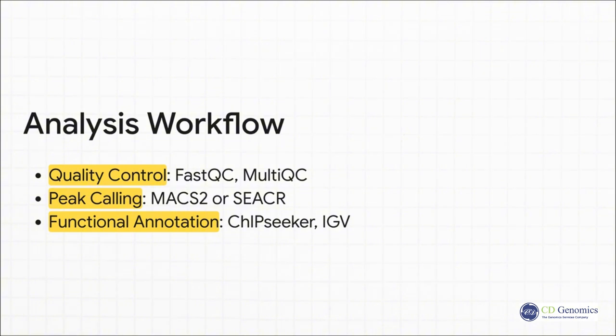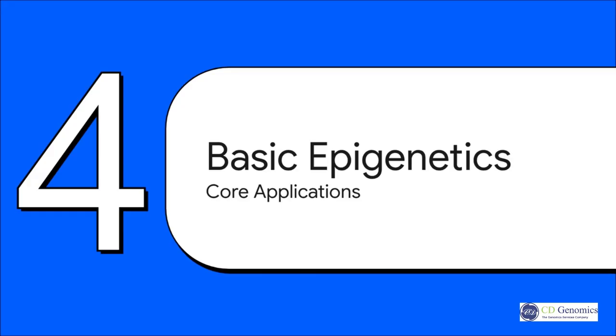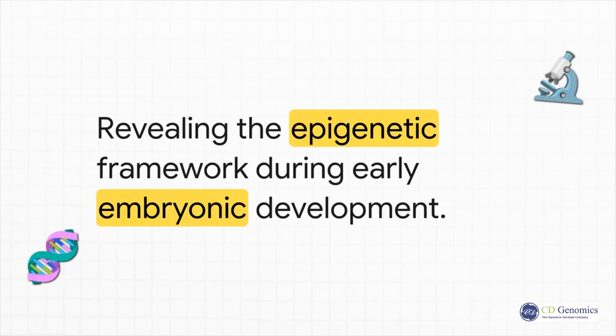Now, let's look at how this pipeline actually answers real biological questions. Which brings us to Section 4, Applications in Basic Epigenetics. One of the absolute most powerful applications for this is in histone modification analysis.